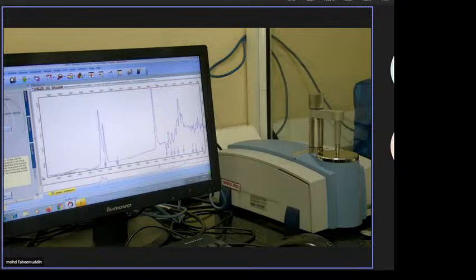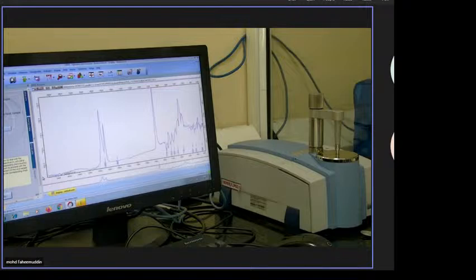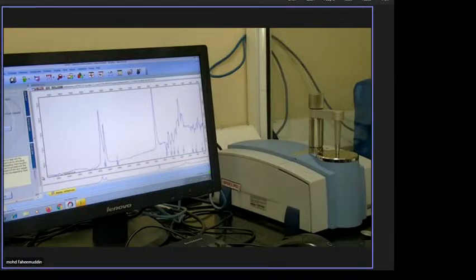Actually, in the regular pharma industry, your entire life is the same instrument, same molecule, same method. That is the manufacturing process, so there is no chance of doing new or different things. For example, you will be placed in a metronidazole tablet manufacturing unit. They do metronidazole daily, you get metronidazole samples daily, with the same methodology, same Shimadzu HPLC, same solvent system, methanol, same injector, same detector, same sample, same result.